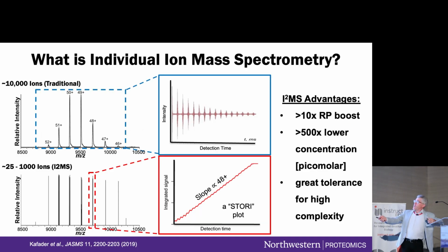So here's a native tetramer sprayed with native electrospray, and you see the different charge states, for example the 50+ charge state. This is obtained classically with ensembles of ions. You would get enough ions, 10,000 ions, in an Orbitrap. This is all with Orbitrap Fourier transform mass spectrometry. The way that you would generate signal is the constructive interference of these different frequencies, spinning around in a motion I haven't shown you, but I will. Their frequencies are different, so these things are spinning at lower frequencies or higher frequencies according to mass to charge.